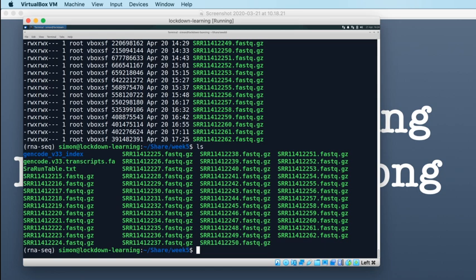So the first thing that you want to do when you've got a table with a header line is remove the header, because we don't want to pull the header into our subsequent processes. So we're going to take off the header line by doing tail -n +2, which prints us everything from the second line of the file to the end of the file. So that just removes the first line of the file. That's removing that header line.